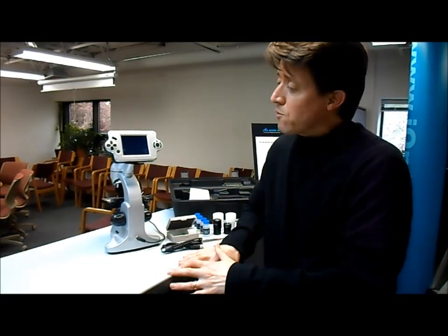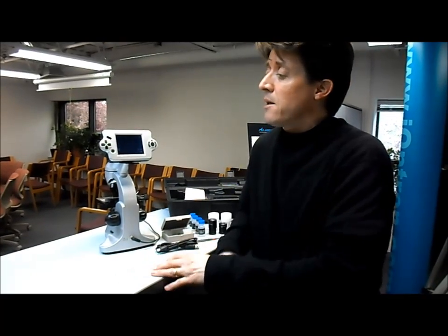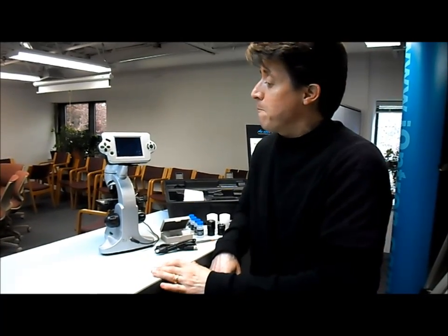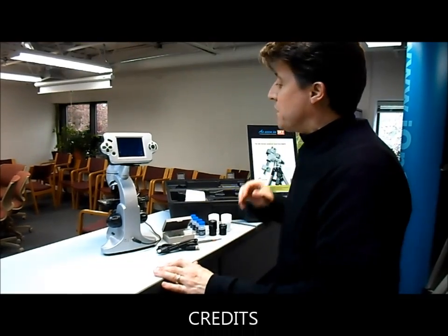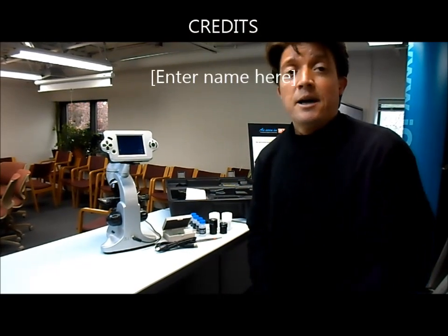It's a great product for classrooms, and it's also good for students with visual impairment, helping them see better. It has a lot of nice features and 3200x magnification, which is great for the price. Thanks a lot.